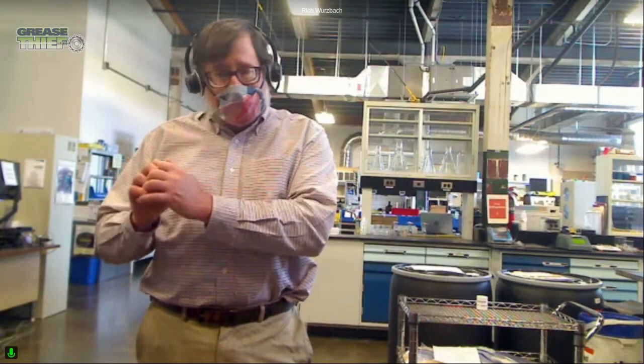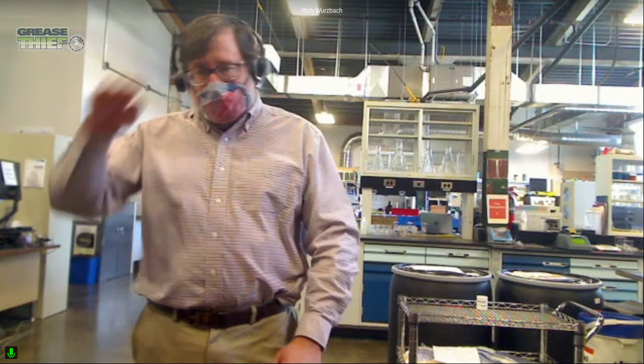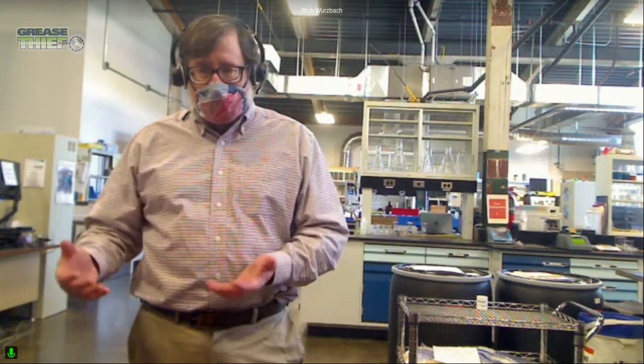And a big part of that is that oxidative life, the loss of antioxidants, and getting the grease replenished before it starts to degrade. And one of the best tools to do that we have found is the ruler tool in the way in which we shared it with you today. So I hope that's helpful. I hope it raises some ideas about how to use grease analysis in the right way to get even more sophisticated, if you will, in how we treat our assets and take advantage of that kind of data and knowledge.